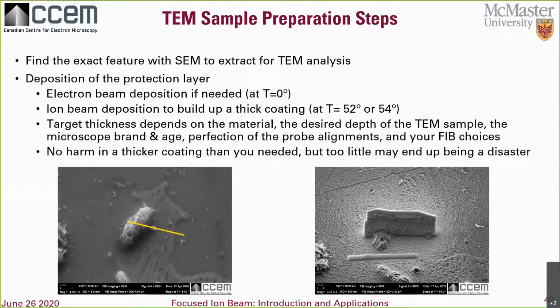So as a general rule with FIB, you should always err on the side of caution and quality rather than speed. When you're new to FIB operation, that's really not the time to push the limits of time efficiency. When you are confident in your abilities and have a low failure rate, then you can worry about ways to shave off a few seconds from each step.